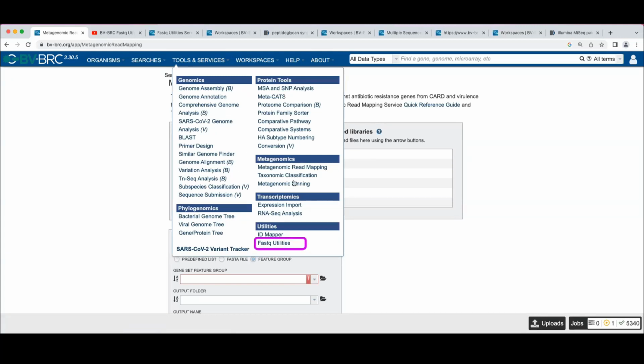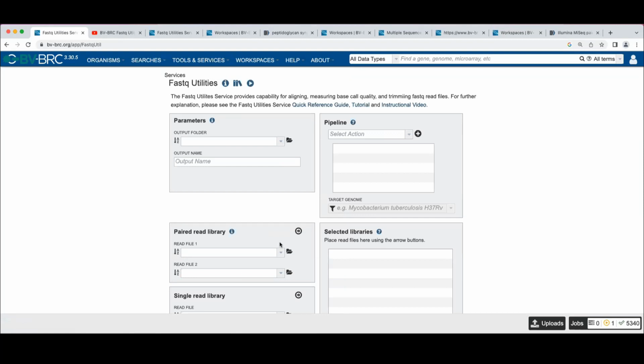We're working on this new paper for BV-BRC, and it's going to be pretty much the same workshop in a paper format. And I started with taxonomic classification, just what you're seeing here, because as a biologist, that's the way I move forward. The editor is a computer scientist, and he said, oh no, everybody does read quality first. And whatever, I'll have words with him. I don't mind changing it, although the paper's already formatted in this numerical form, so it'll be a pain for me. But it depends on which branch of the biological analysis family you're coming from.